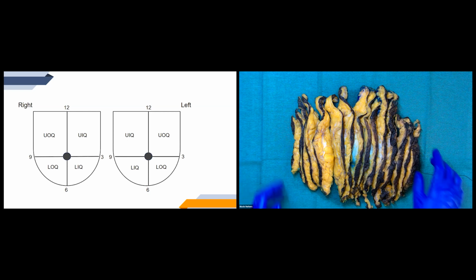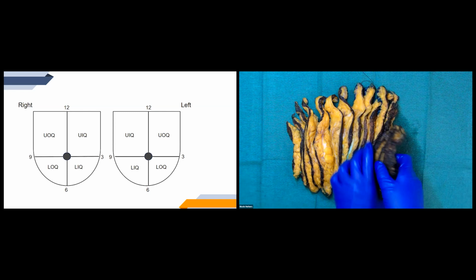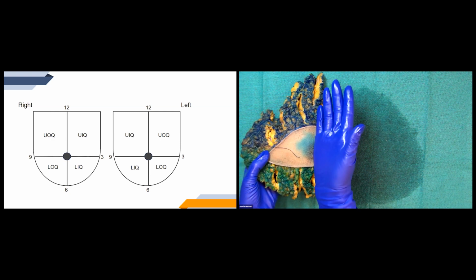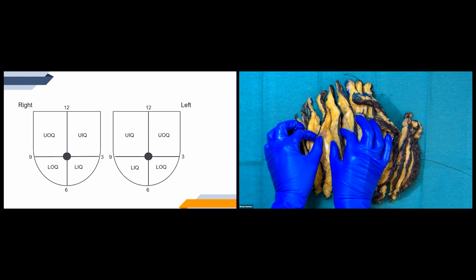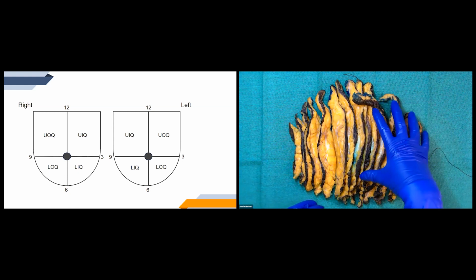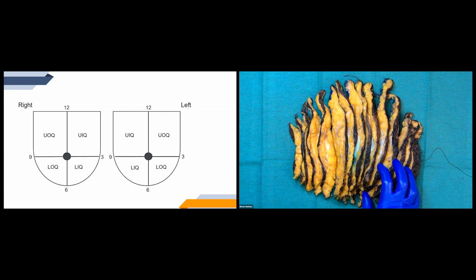So for our breast here, we have our lateral suture here, our superior here, our nipple here. So this would be our kind of midpoint. I would know that my cancer here would be in the upper inner quadrant, because this would be the outer region and this would be the inner. So I would go, this would be upper inner, lower inner, upper outer, and lower outer.